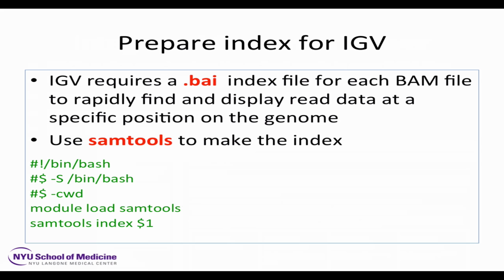It uses moderate compute power, too much for 60 people to all do it on the head node simultaneously. So instead you put it in a shell script. It's super easy. All you have to do is samtools index filename. So typically you would go to TopHat, JZ5, accepted_hits.bam, and then just type samtools index and the name of that file.